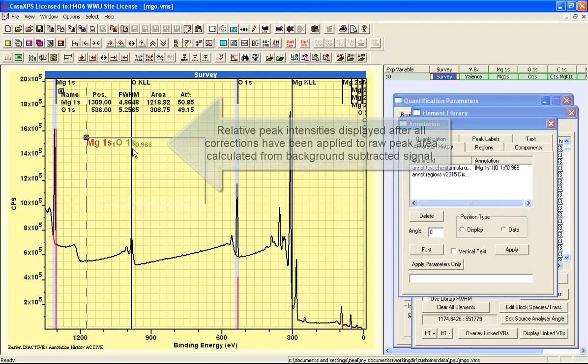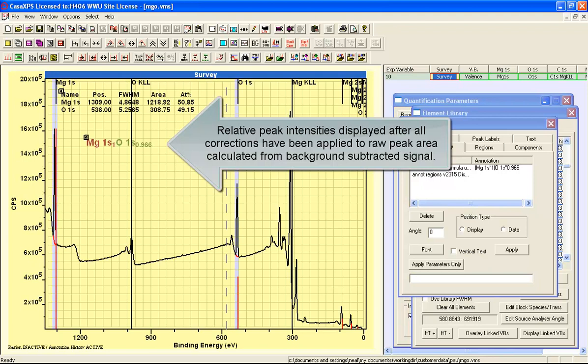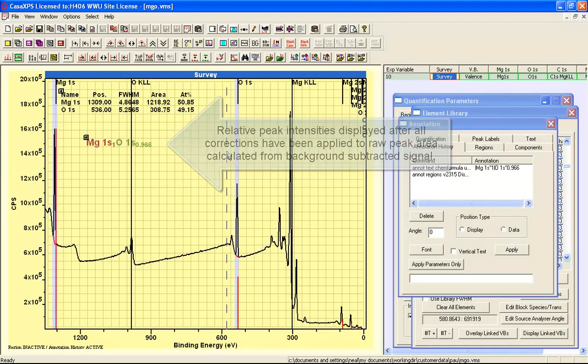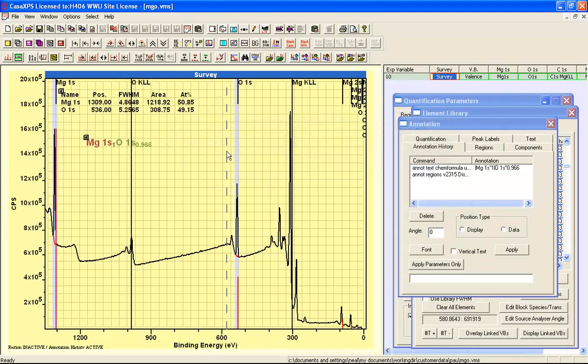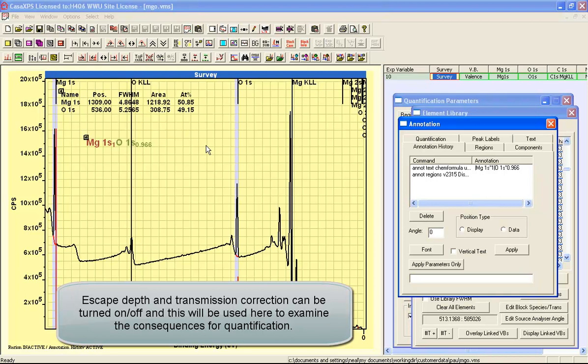So as it stands, you can see that this now looks like we've got a 1 to 1 relationship, which is what you'd expect for magnesium oxide. The quantification results here of 1 to 1, or close to 1 to 1 anyway, have been achieved by using Schofield cross-sections. So let's now look at the other corrections that are involved in producing this quantification as you see it here.